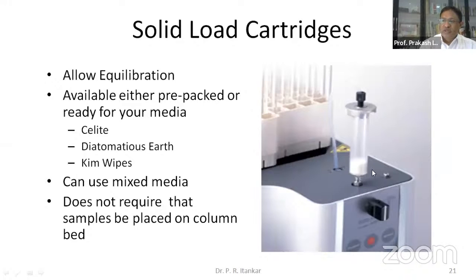So activated silica will offer the surface area needed for adsorbing that particular extract on it, and once you have that adsorbed on the silica gel, you can load it here, and that will allow the solvent to pass across that particular bed, will leach out the desired constituents according to their solubility or affinity towards the solvent system, and it will go on the column first. So that kind of arrangement is possible.